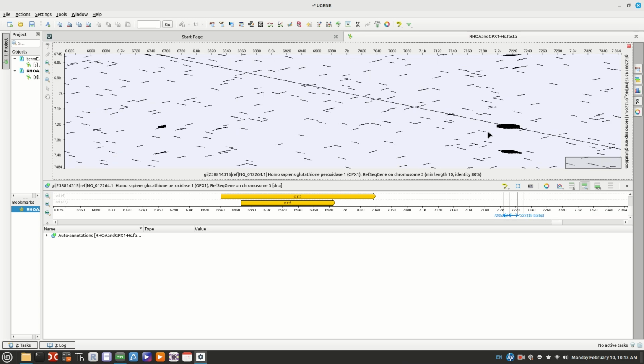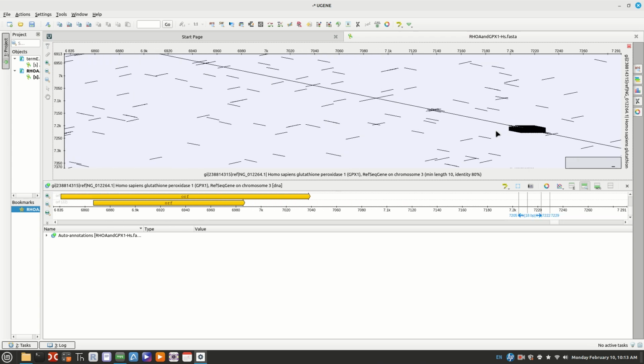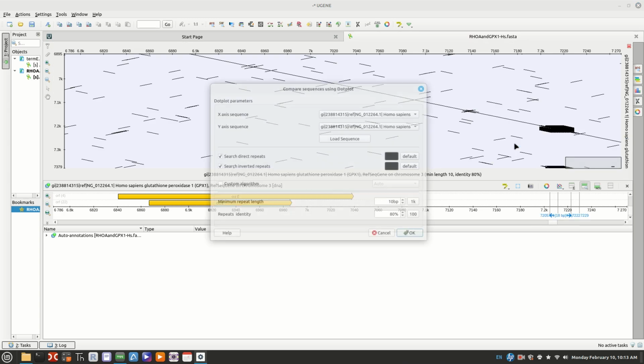Let's zoom out a little. Look along here. You really want them a little further away from the center, but that would look better than what we've got going on here. And of course, you're speculating. You don't know that this is where the terminator is. The best you can do. Here's a little cross out here, a little far away, but it's on both sides. Here you've got one in the middle. You know, that could be a terminator. And here's a low. It's in the right spot.